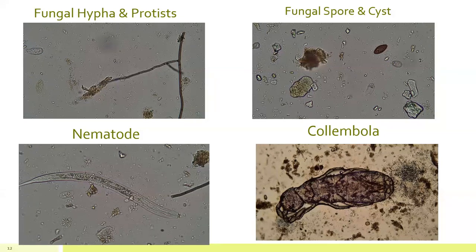So once the conditions are right, they will actually come right out of that dormant stage and start functioning as well. And lastly, just so that you can see a little bit of bacterial diversity, this strand right here is actually an actinobacteria. So that just goes to show you the type of morphology that we follow in terms of bacteria.